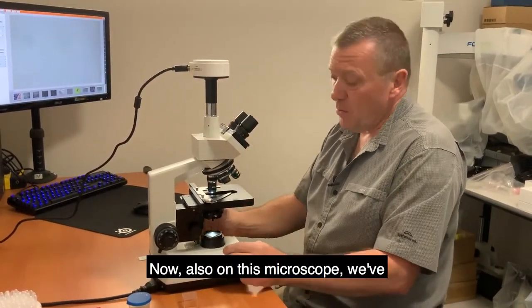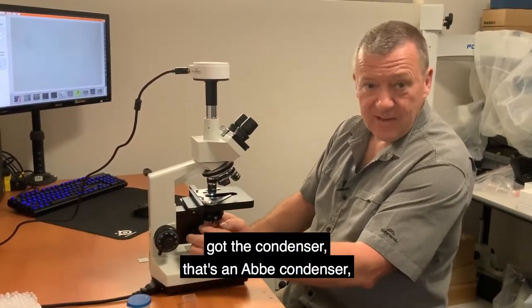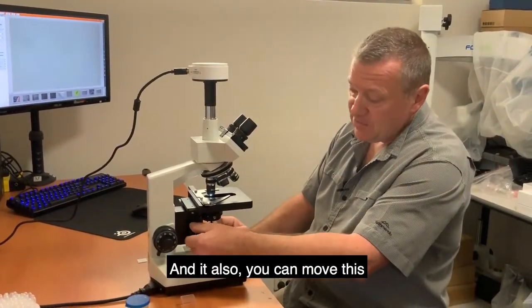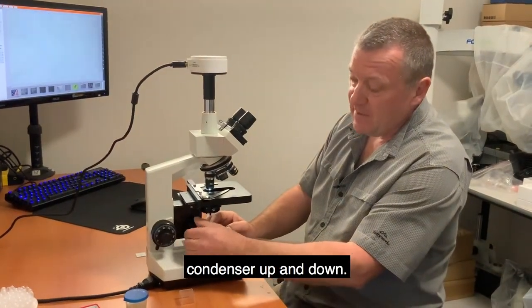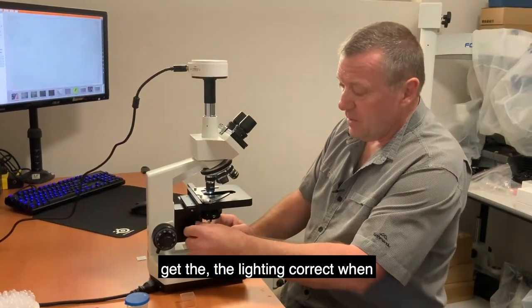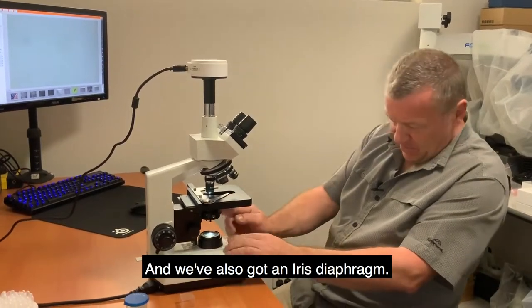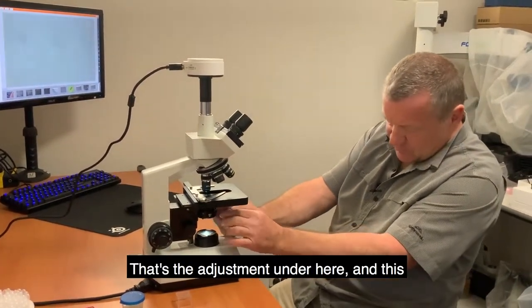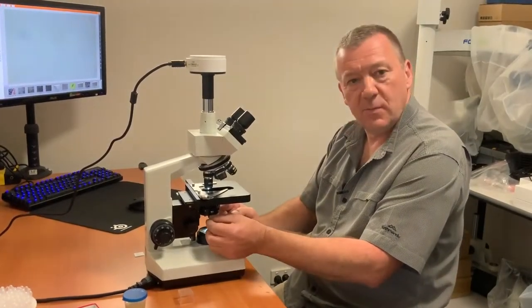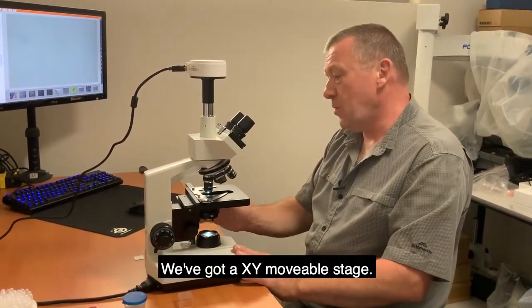This microscope has an Abbe condenser with a numeric aperture of 1.25. You can move the condenser up and down, which is important for getting the lighting correct when looking at a specimen. There's also an iris diaphragm — the adjustment underneath — which controls the amount of light getting through to the objects from the light source.